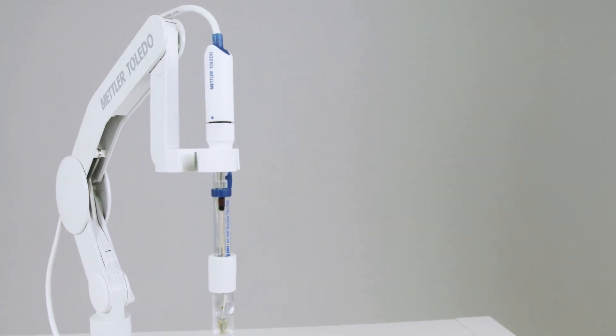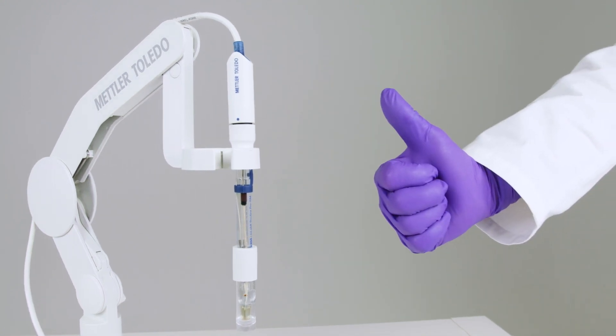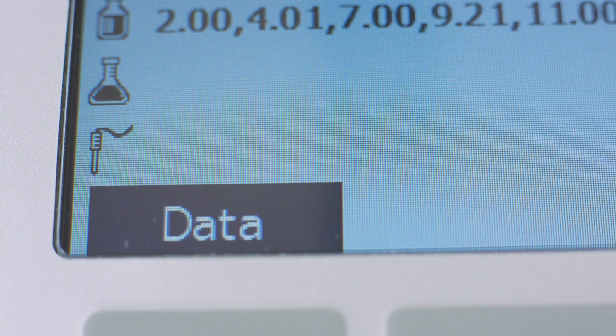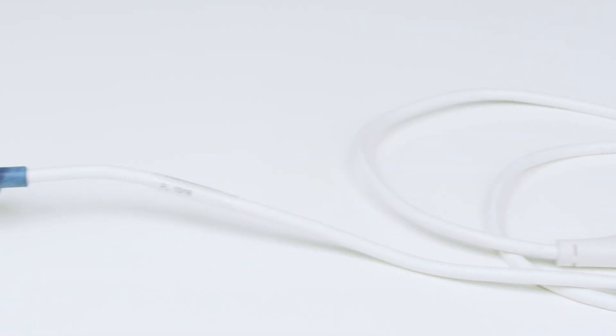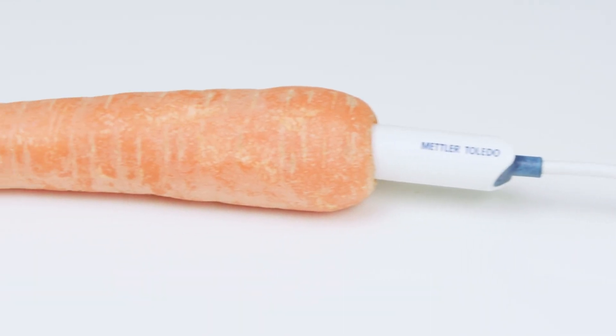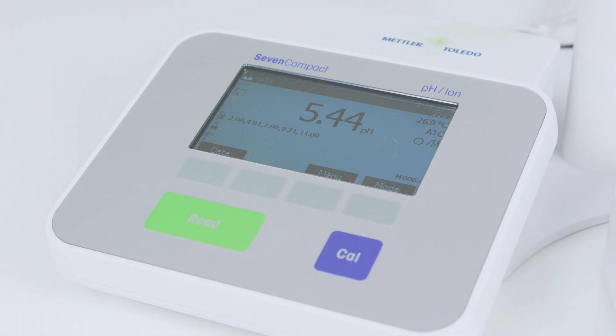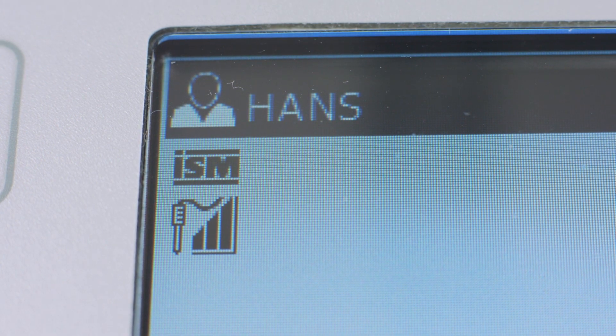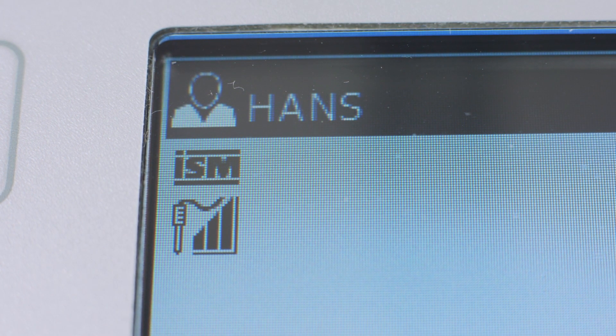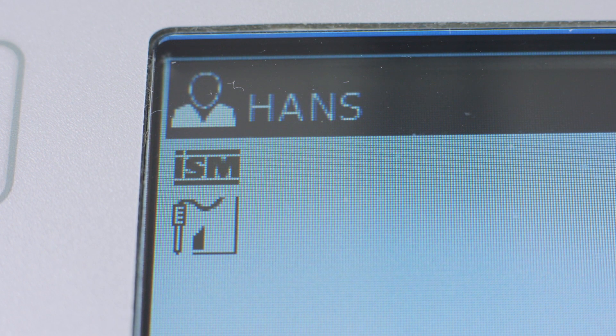Okay, now that the meter is set up, let's get hands-on and prepare that sensor for action. When you plug the sensor into the meter, the sensor's ID is helpfully displayed to help prevent little accidents, like using the wrong sensor, right Hans? If you're using an ISM sensor, the ISM logo will also appear in the display, and the sensor may display a condition icon, which indicates the condition of the sensor and if it needs cleaning or replacing. This icon may not appear till after calibration, depending on when you last calibrated the sensor.